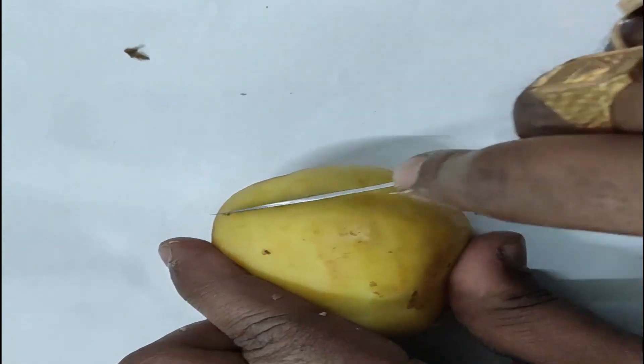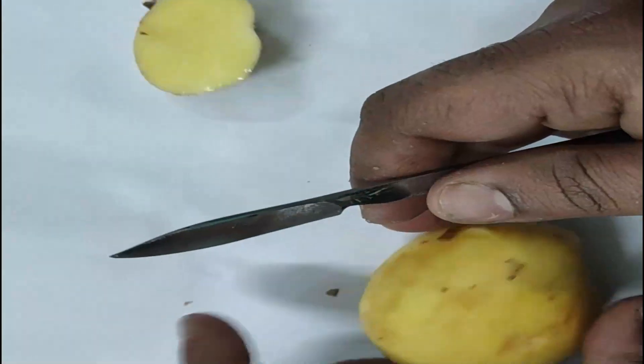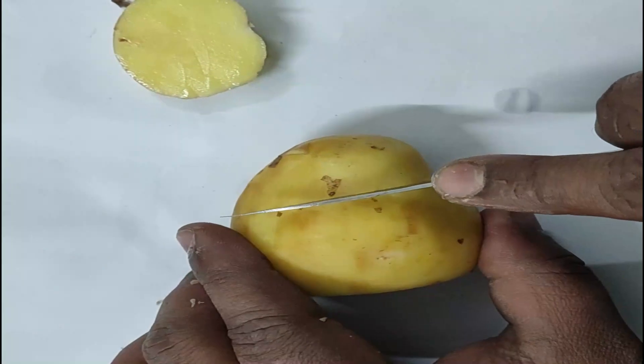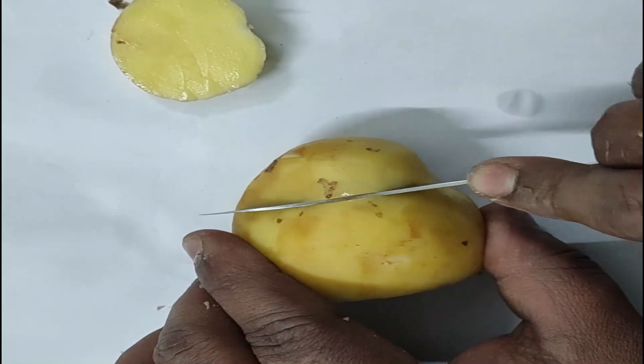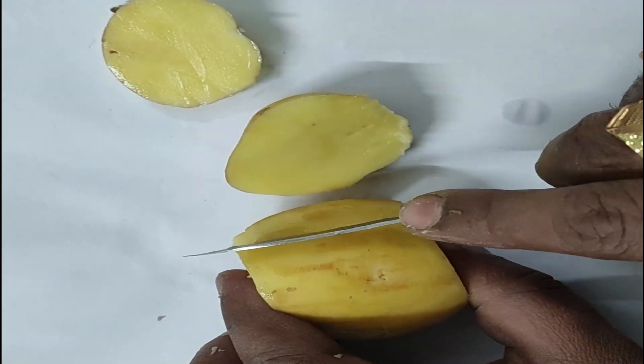Then we have to make a cube, so cut like that on one side to make one corner flat, and by the same way make the other corners flat to get the potato cube.